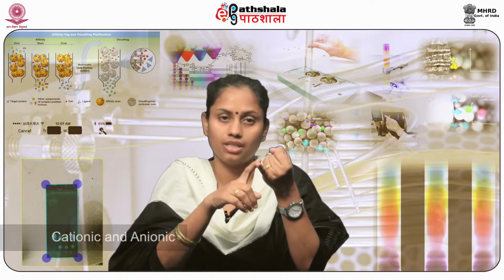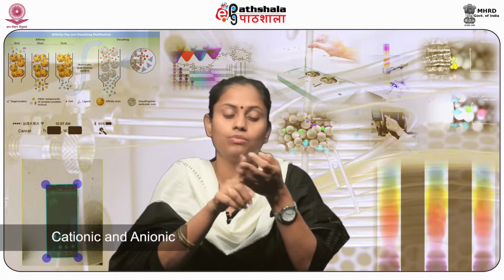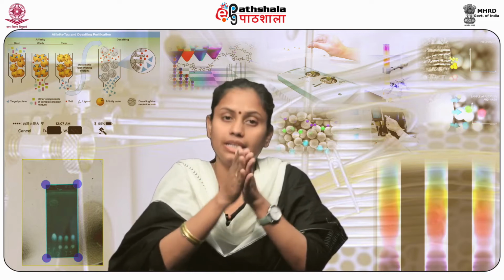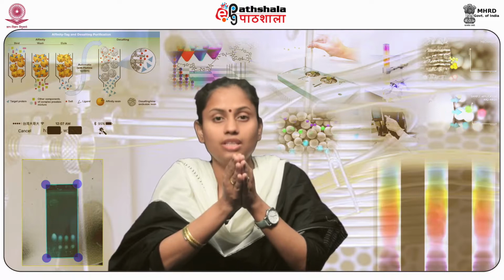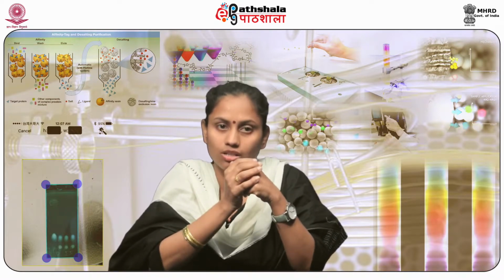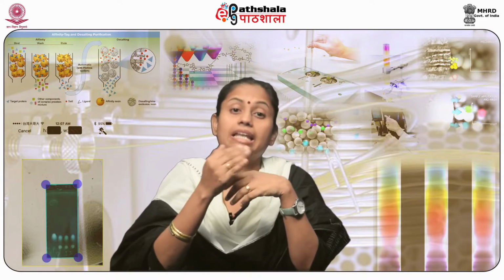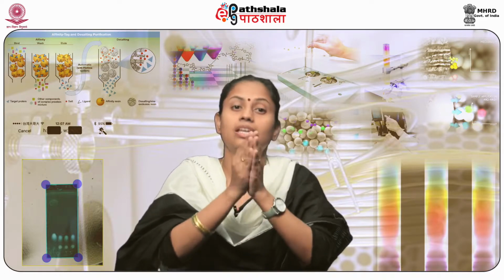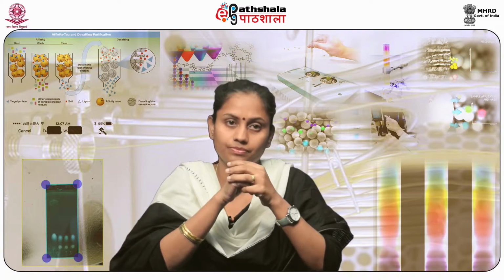It can be cationic and anionic, which is again dependent on the type of resin that we use. In a cationic exchanger, the stationary phase or the matrix is negatively charged, whereas in an anionic exchanger, it is the reverse, that is, it is positively charged.